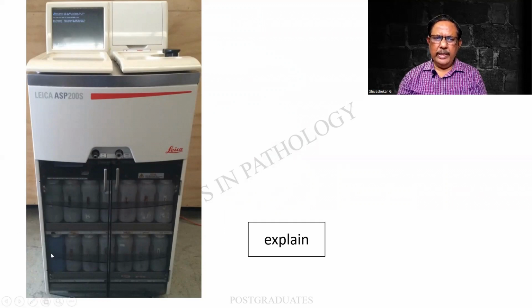It will be up to the clearing agent that is available in all these jars that we are seeing. Fine. And here only you will be having the molten wax, and then there will be a dipper or a tray for which the tissue capsules can be kept. I will be showing a picture of it. And this incidentally happens to be the monitor by which you will be able to control.